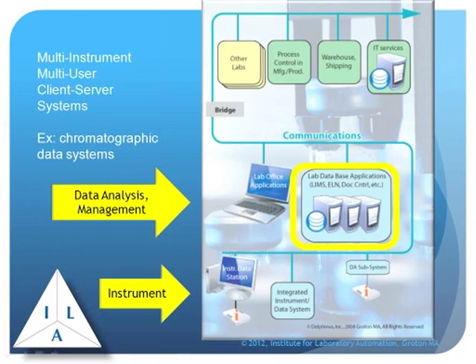In terms of how the hardware actually lays out, it looks something like this. The data analysis and management system reside on a departmental system, and the instrument system still sits on the lab bench. And again, it can either be an instrument tied to a computer, or it can be a completely isolated subsystem where there is no computer except for the database system and the computer that the analyst uses for doing the work.